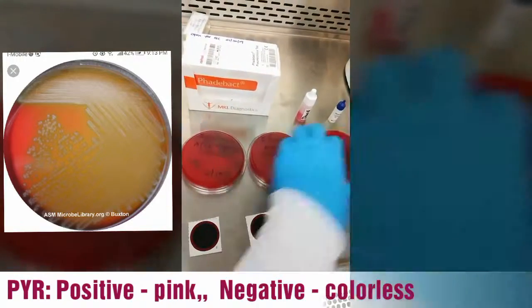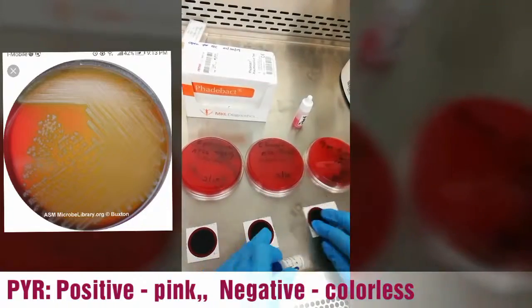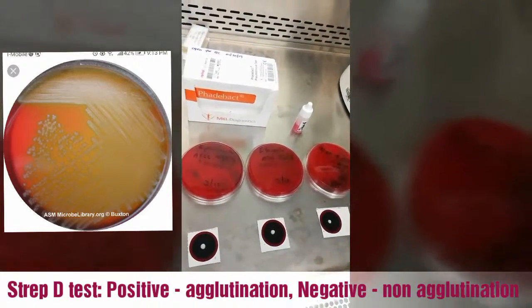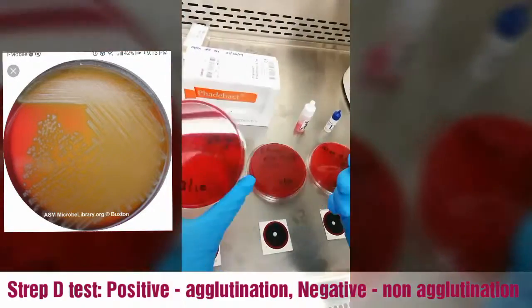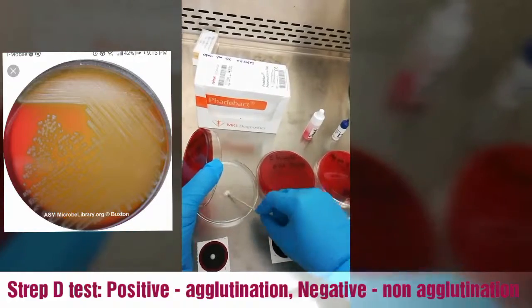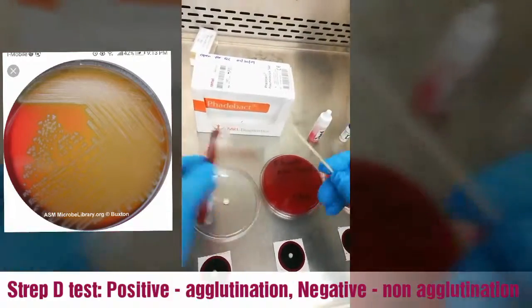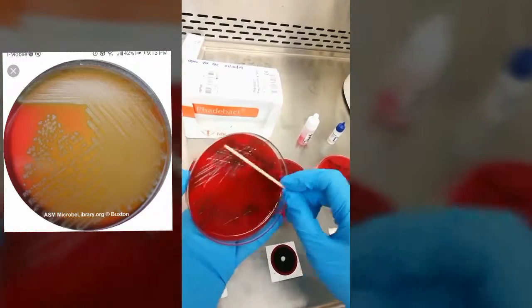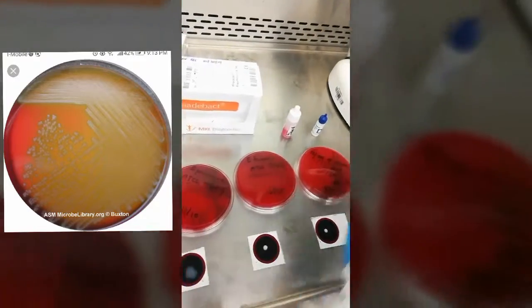We will now use the biochemical tests to speciate the differences between Streptococcus pneumoniae, Enterococcus species, and viridans strep. The PYR test, strep group D test, and pneumoslide test are very important for alpha Streptococcus speciation.